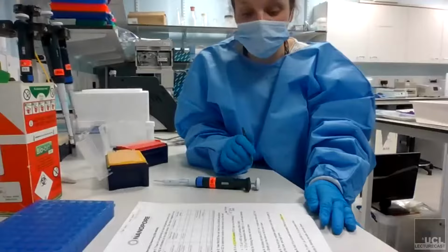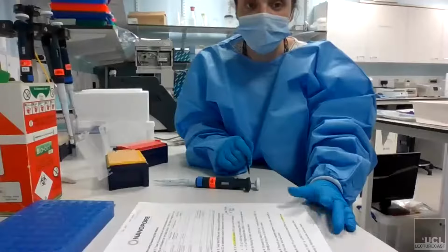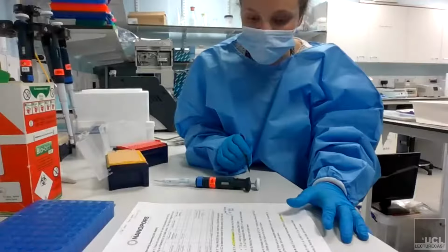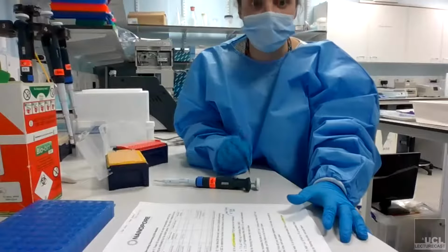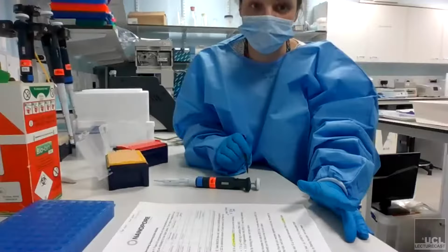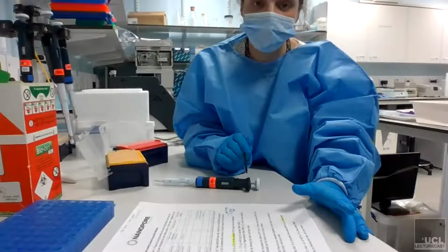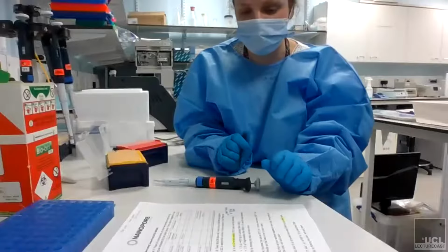Does it work also for arboviruses, this protocol, or do we need to do the other protocol? I guess it depends. If you have the correct amount of nucleic acid that you need, then yeah, I'm not really that familiar with sort of culturing of viruses. If you can get that amount of DNA or RNA. How much DNA? 400 nanograms. 400 nanograms. Okay. It's roughly 53 nanograms per microliter. But also, I presume with a virus, you'd need to get 30 kb as well, wouldn't you? So that would presumably be quite difficult for some viruses, I imagine.